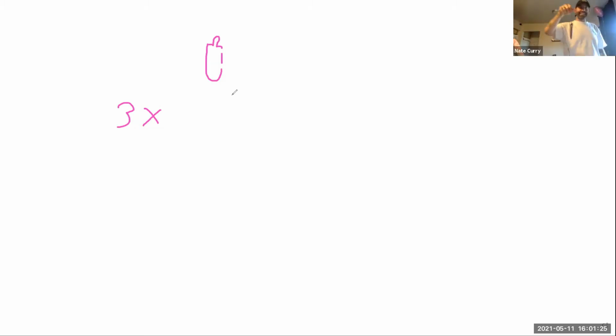Yo, look at that mix I got from the centrifuge. That's a good mix.